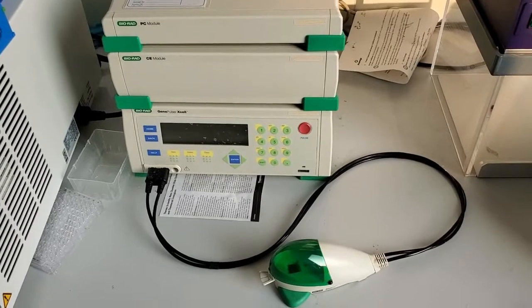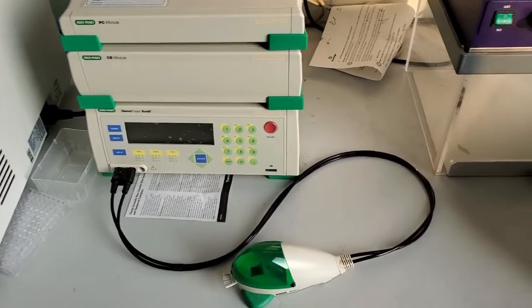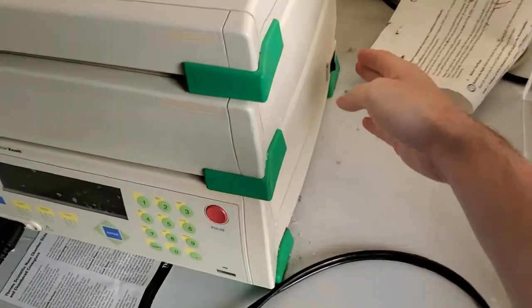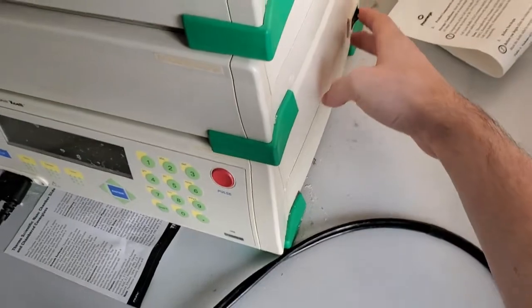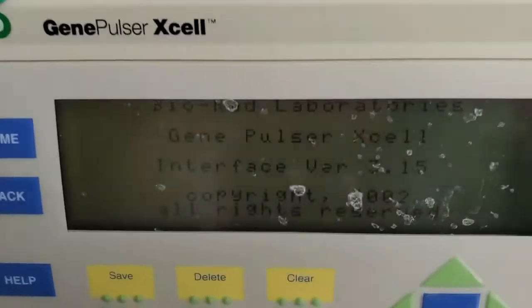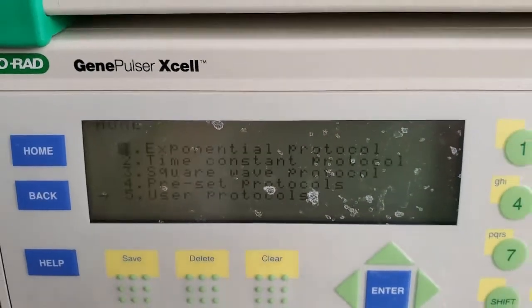So this is your lab grade electroporator. It's fairly simple to operate. There's a power switch on the side. Turn that on. You see it starts to load up.